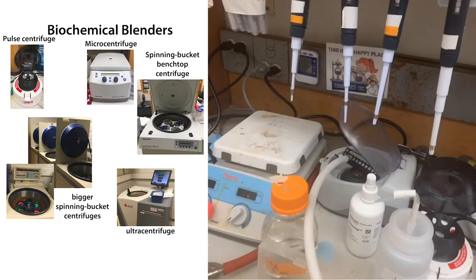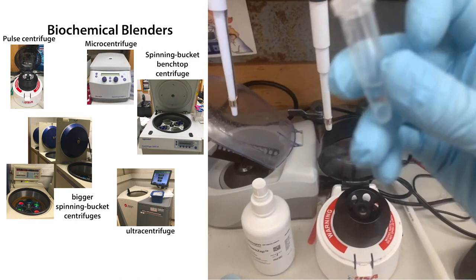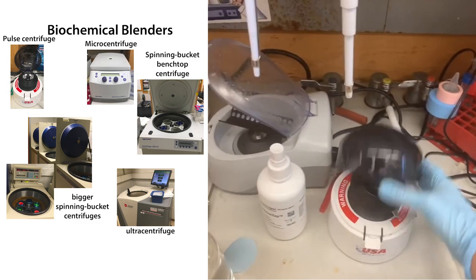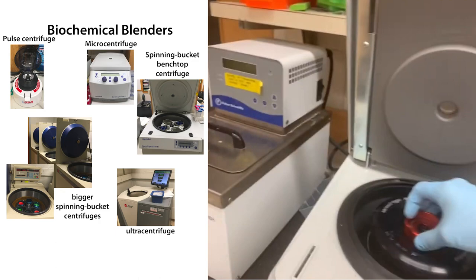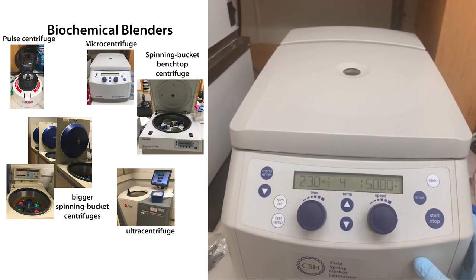We have little pulse-spin centrifuges — a centrifuge spins really fast, and the conical bottom is handy because things pellet to the very bottom so you can suck out the liquid from above. The pulse centrifuge is a small benchtop one for quick spins. For more controlled, longer, and faster spinning, we have benchtop centrifuges where you set the speed and duration — this one even has refrigeration, though not all do. We also have much bigger centrifuges I'll get to in a moment.